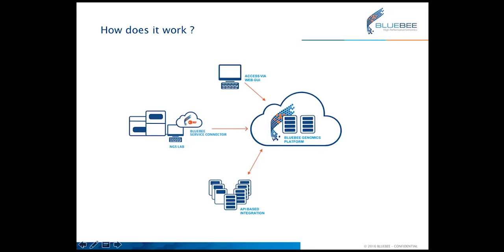You as a user can access the platform via the web GUI, and at all times you can see what the result is of your data analysis, or also how your analysis is progressing. For big volume users, we also allow API-based integration to automate everything end-to-end so that no user access is required.